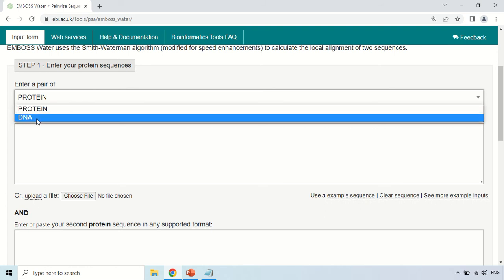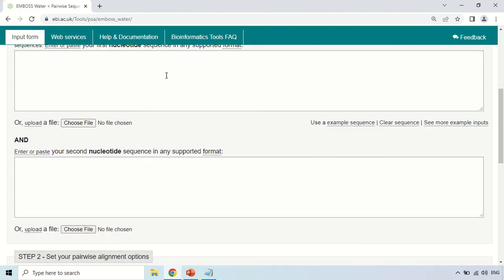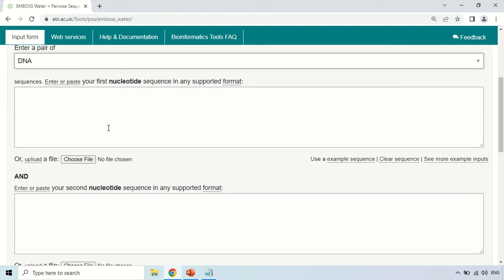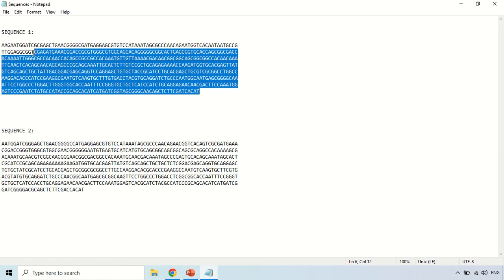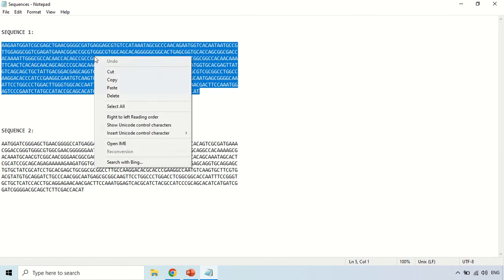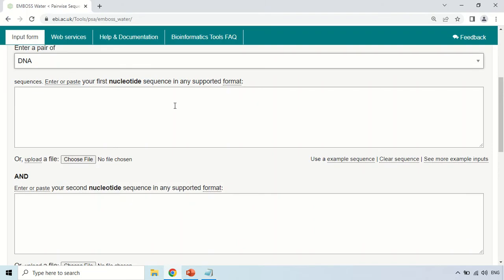I am changing the sequence type to DNA. There are two boxes, and in these two boxes you have to paste your two sequences. In the first box, enter your first sequence and in the second box, paste your second sequence. For demo purposes, I have already downloaded two sequences, and I am now copying the first sequence and pasting it into the first box.